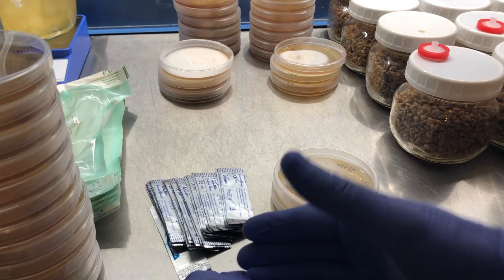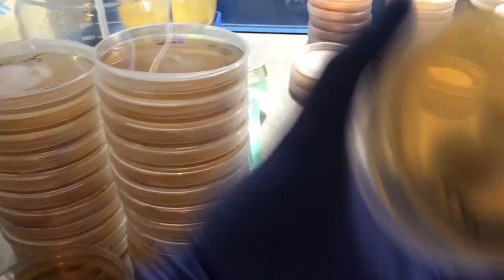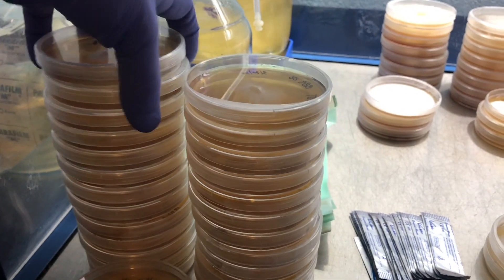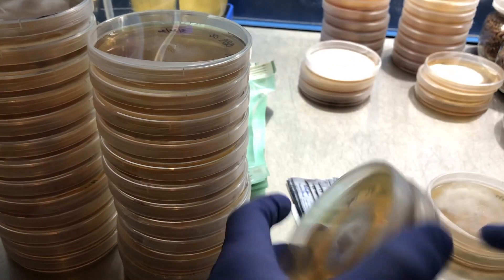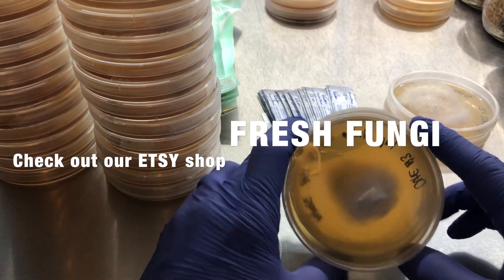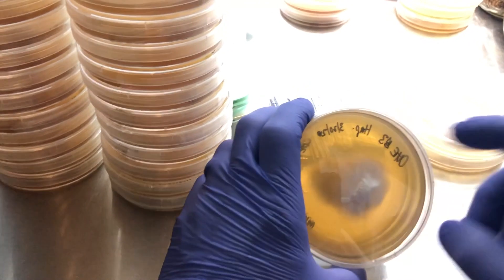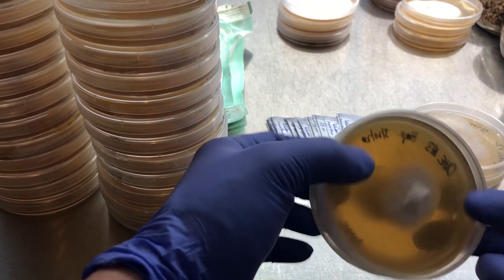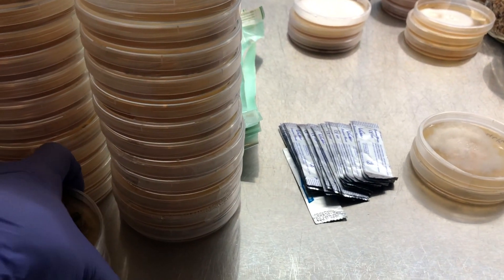We'll be watching these very closely over the next few days to see the mycelium crawl through the grain, and then we're going to put those into fruiting and select for the most robust strains we can get out of this whole batch. I've also got a bunch of piapini crosses — they still haven't quite merged yet, but about half of those 15 are going to be compatible. I've also got these chestnut haploids that I'm saving and will be posting on Etsy as a CO2-producing mushroom. Hydroponic growers are using these in their grow rooms to supplement CO2 and help the plants.